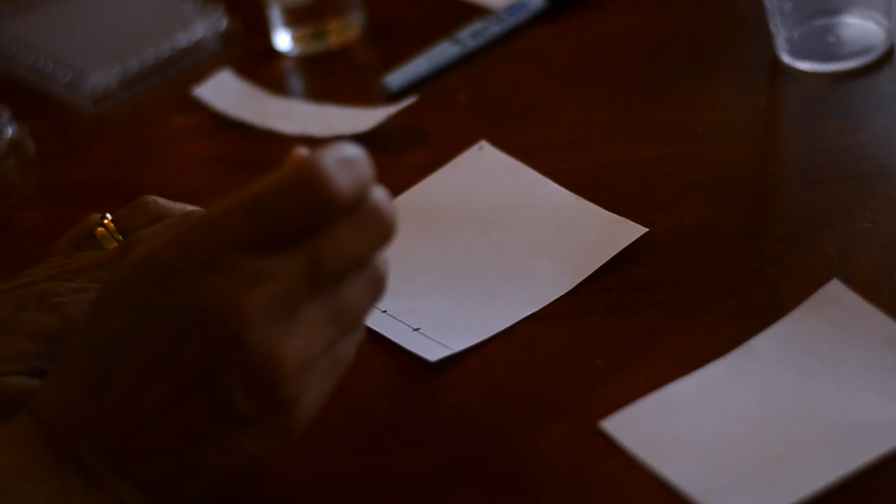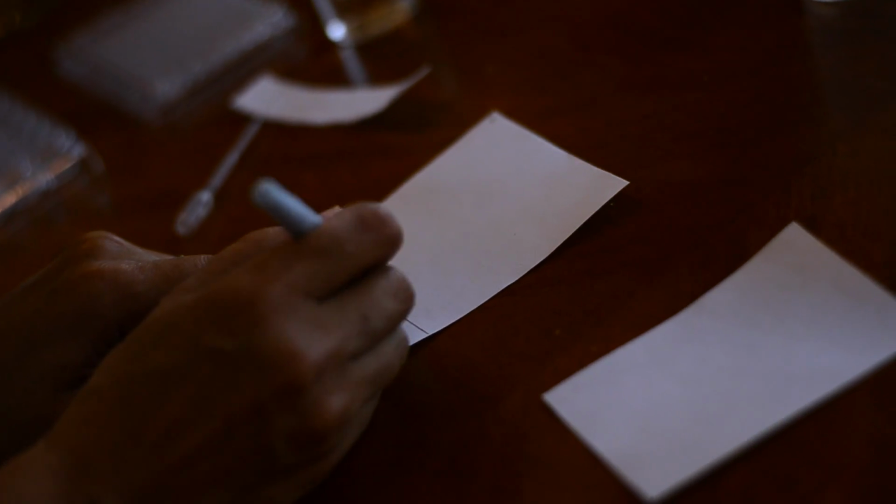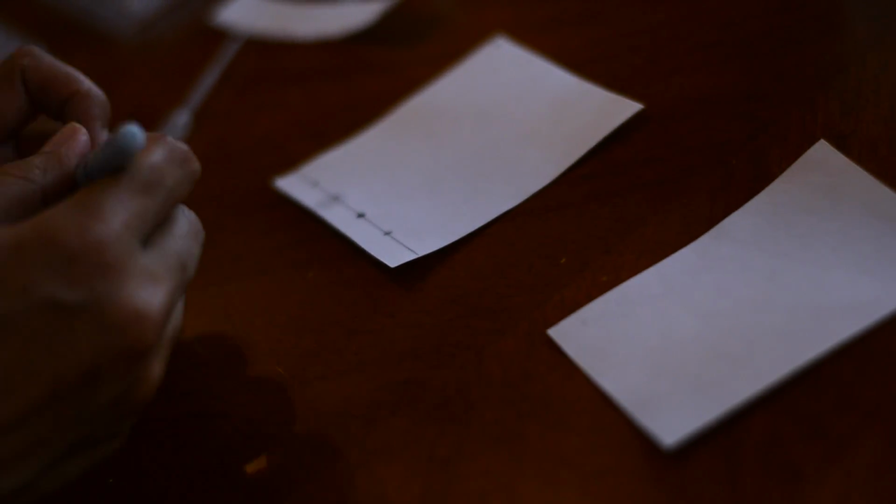I'm only going to apply one drop because I want each drop to dry after I apply it. So that's going to be drop number 1. I'm going to let that sit for a minute and dry. While it's drying, I'm going to apply a spot from the dry erase marker, the felt tip marker. I'll just give that a noticeable spot there and let that dry for a second.